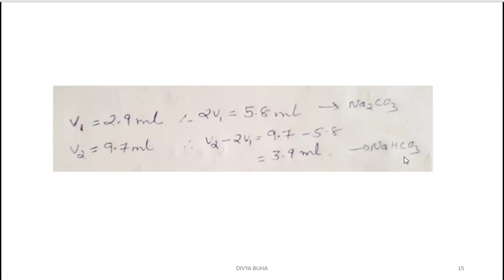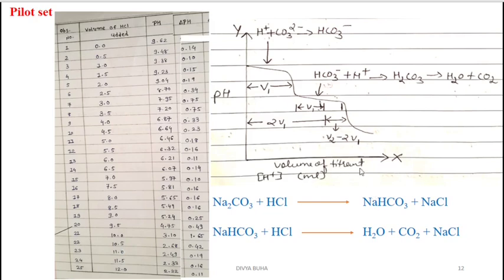Okay, now let us see how NaHCO3 would be determined. We know that at the second equivalence point, or you can say end point, the amount of the NaHCO3 which is being obtained from half neutralization, as well as the amount of NaHCO3 which is already there in the sample, would get neutralized. Okay, so that reading would be V2. So the distance from, or you can say volume from starting up till here would be considered as V2.